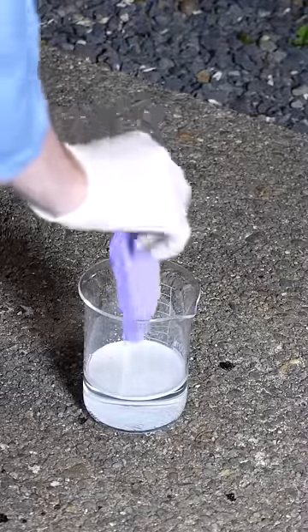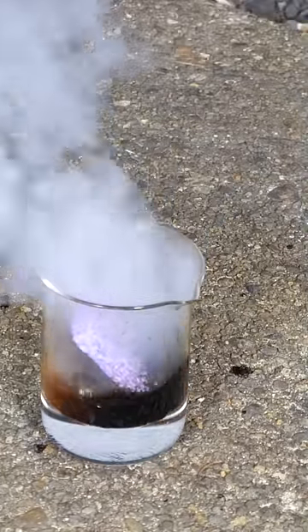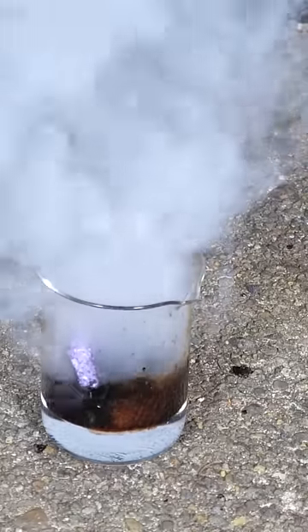Watch what happens when I put a sponge in this. This is an extremely dangerous solution called Piranha Solution. If you put things containing carbon in it, the sulfuric acid in it will eat it away and turn it into pure carbon, and then that pure carbon will turn into CO2 due to oxygen radicals that are formed.